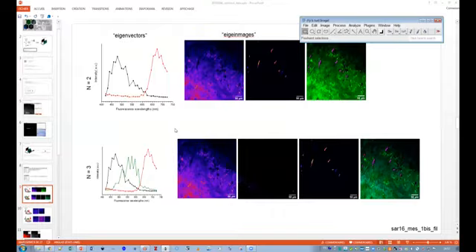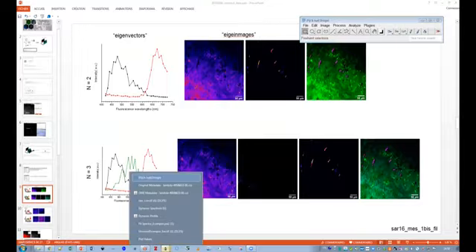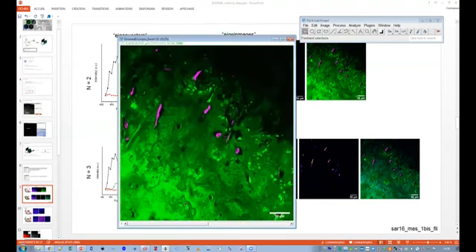Sorry, which image? On your former, on the one that was open, there were 2 buffers, right? Or 2, no? And mixed this one? Yeah. Oh no. Okay, it's the same. Okay, there's only one. I thought there were 2. The bar in the bottom was okay. No, it's the same.